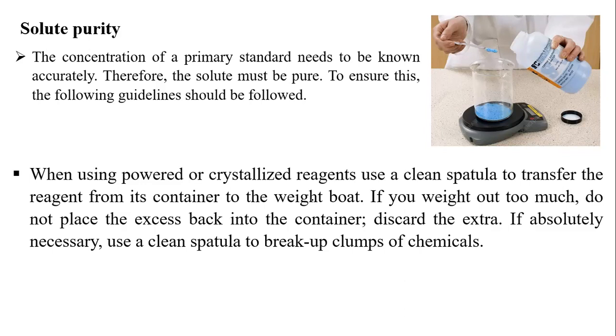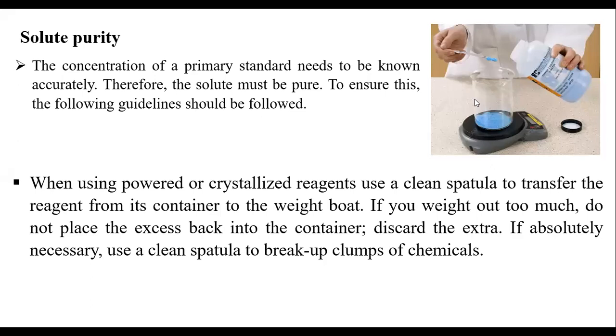If it is absolutely necessary, we have to use a very clean spatula to break up the clumps of chemicals. If it is necessary to touch the chemical with the spatula, you should use a very clean spatula, and we should break the clumps of the chemicals.